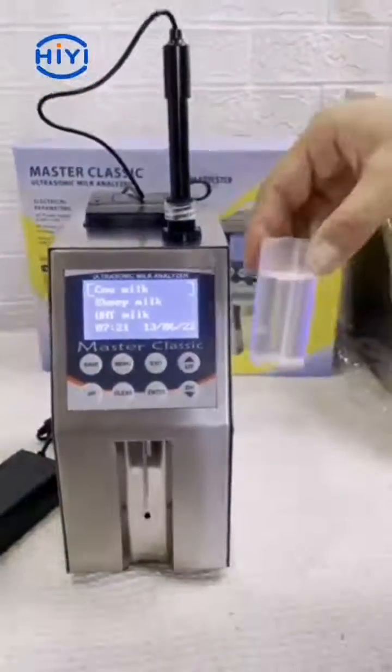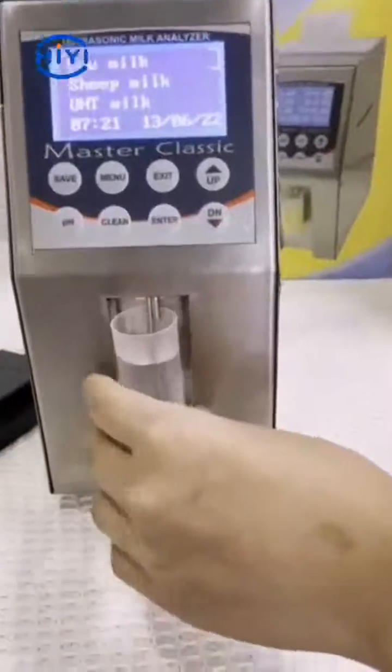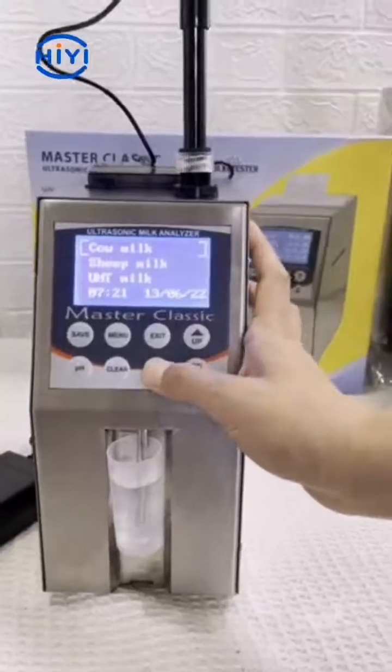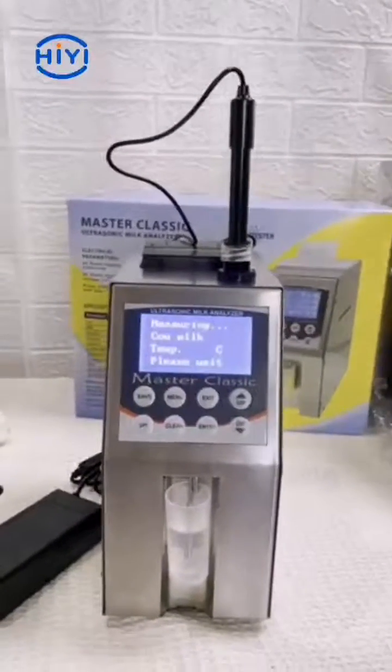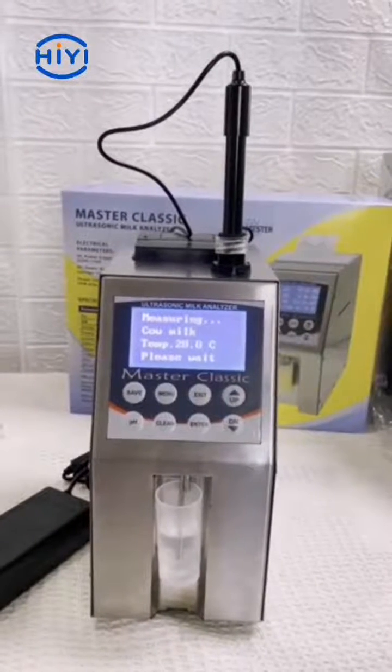We prepared a cup of water for the test. Put the water in, press the enter button. It starts to test.